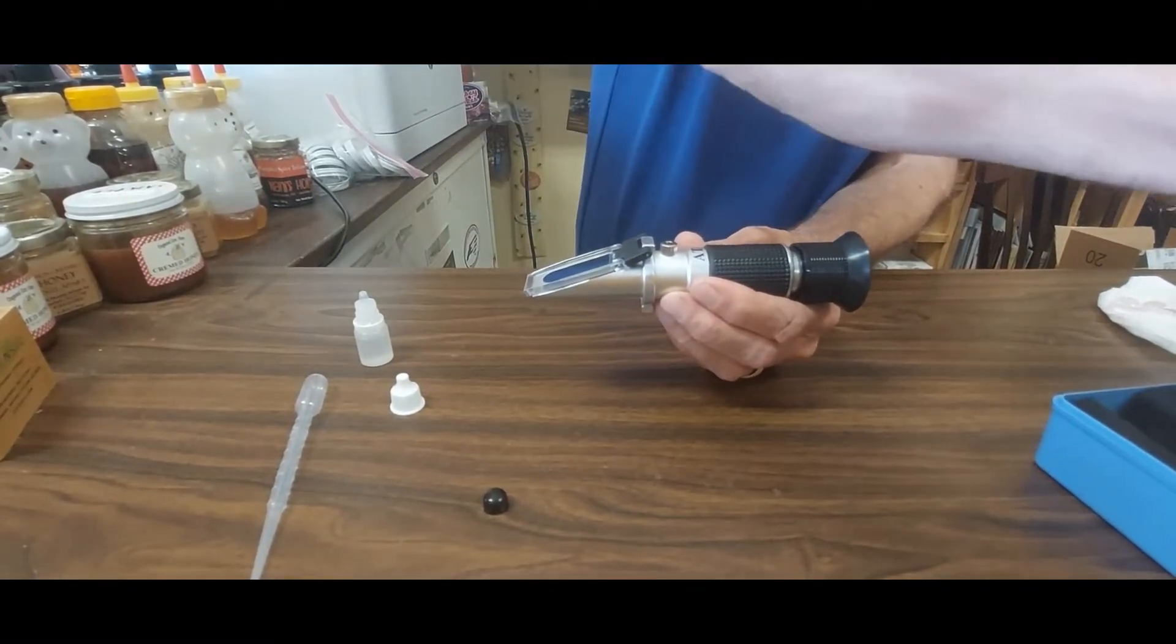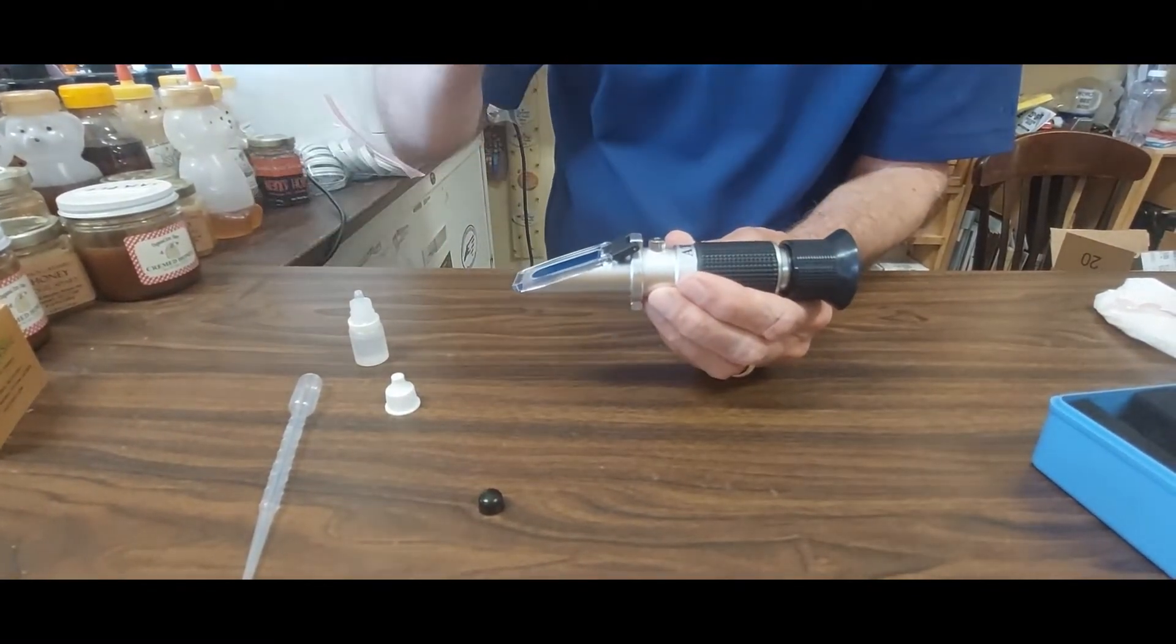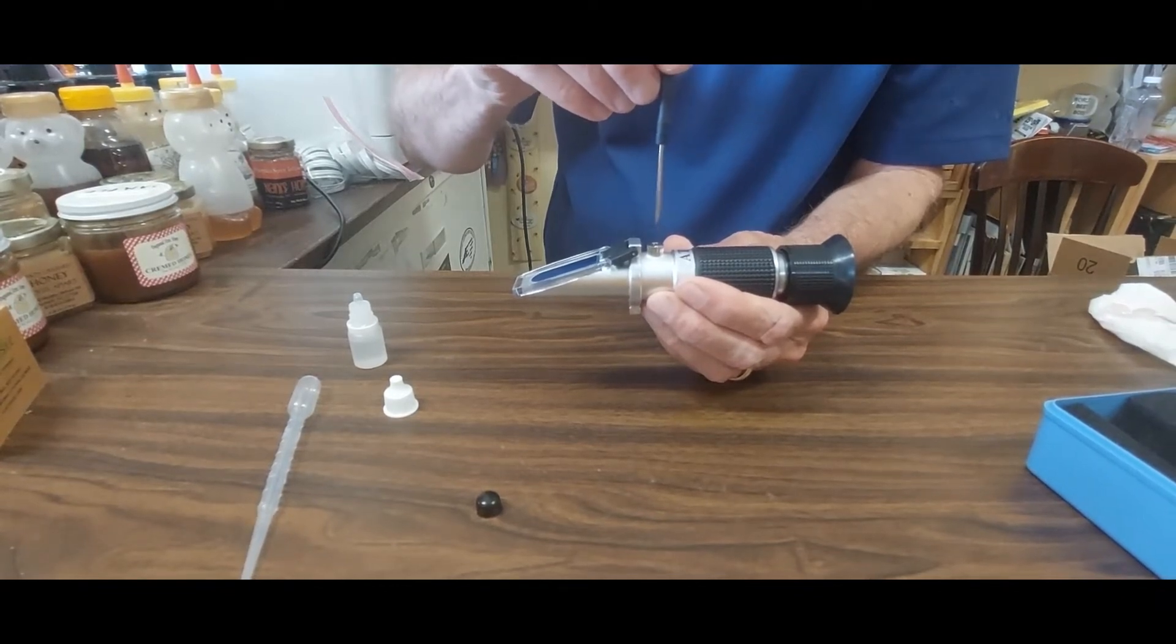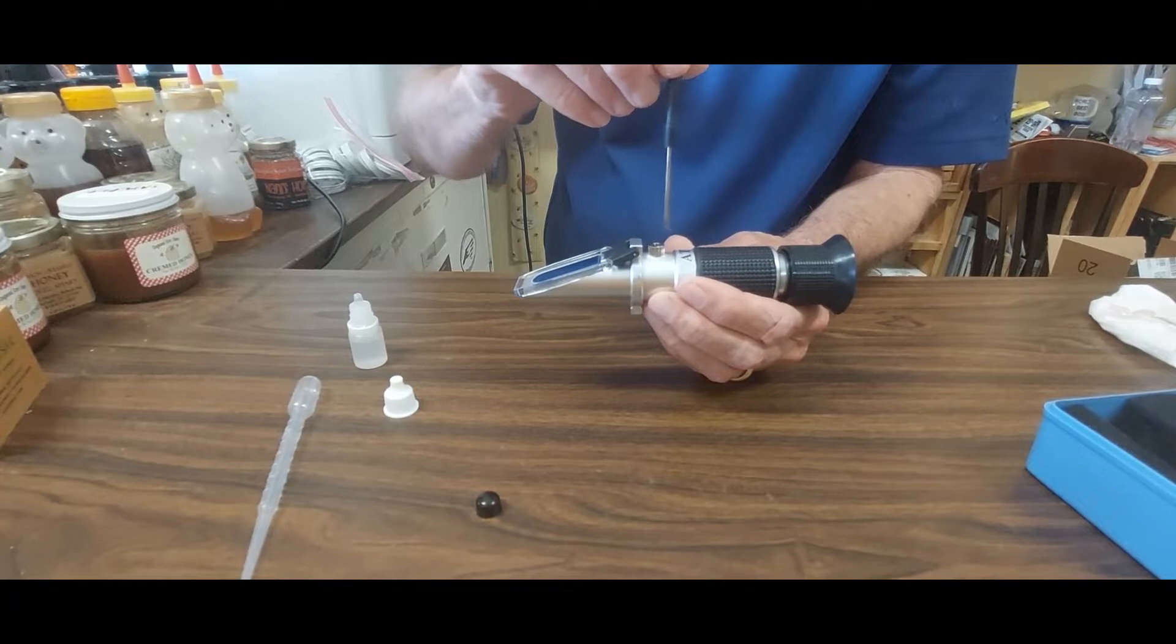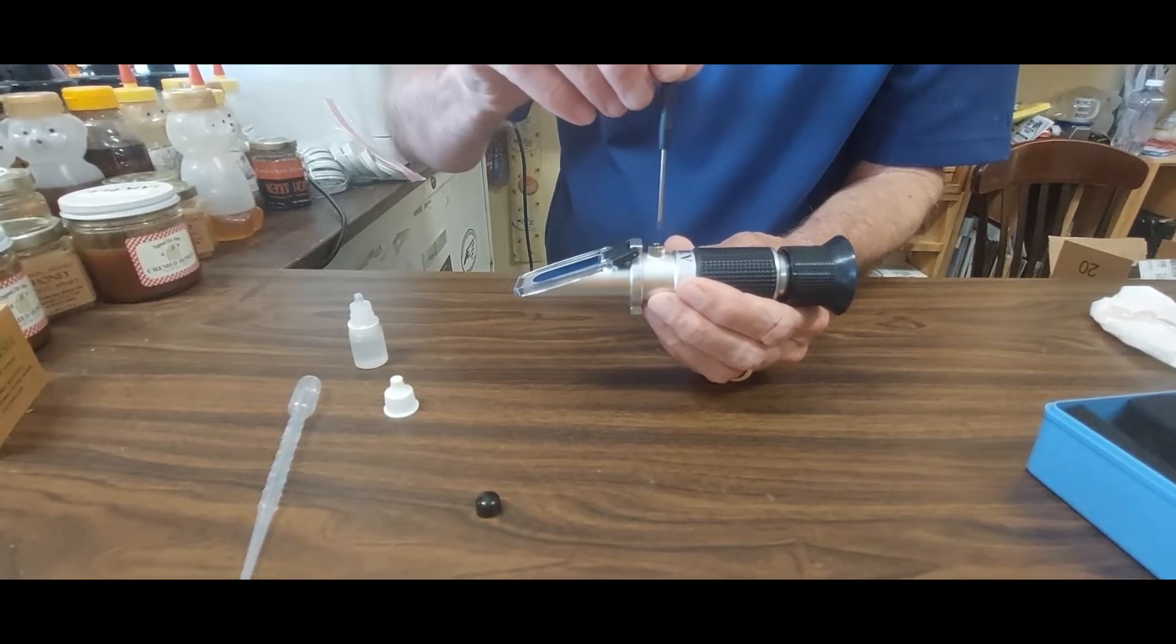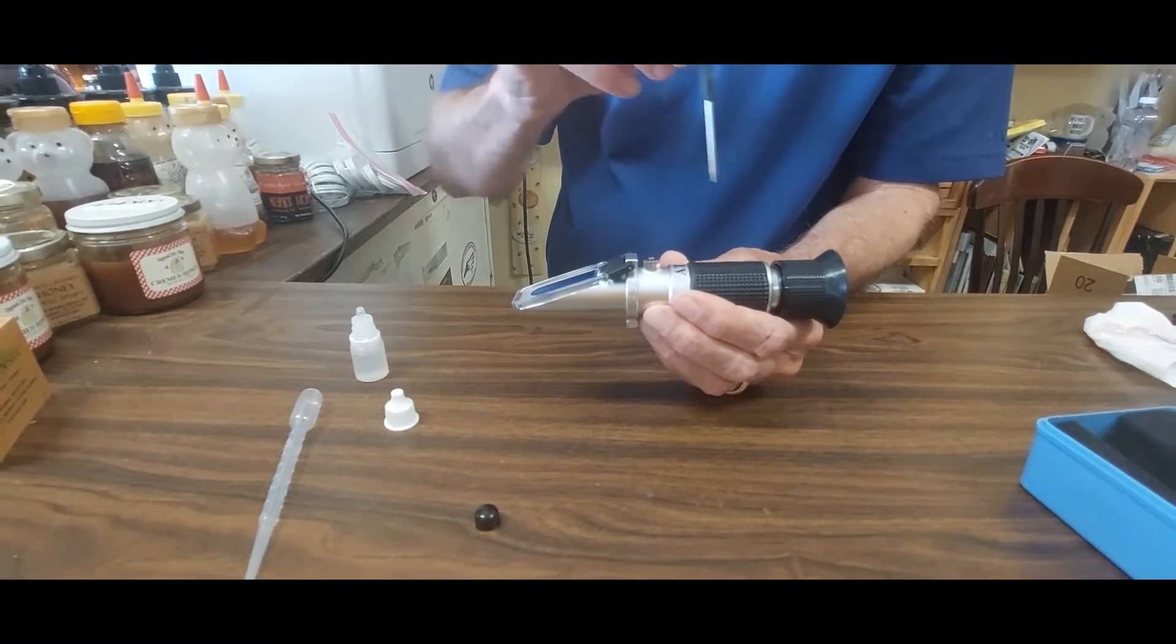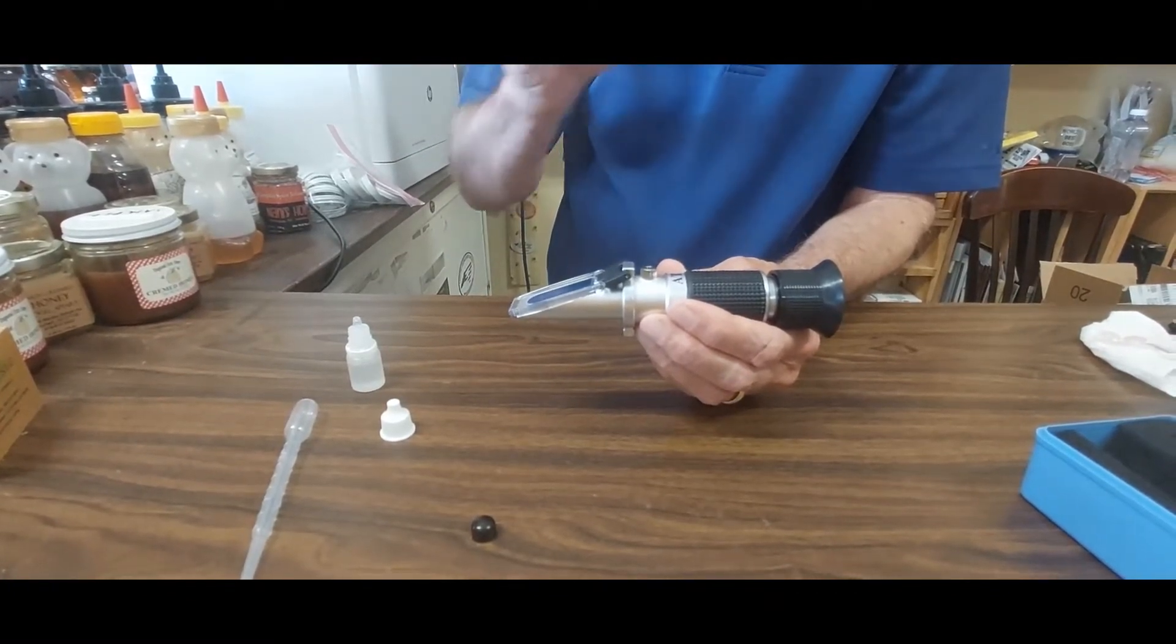And then we have a small screwdriver, and there's a small adjusting screw, and while looking through the eyepiece, you would just turn this little screw back and forth until it's reading on the line that matches the value of your calibration fluid.